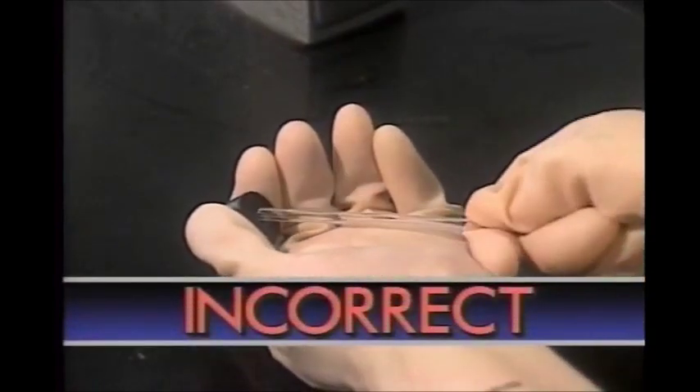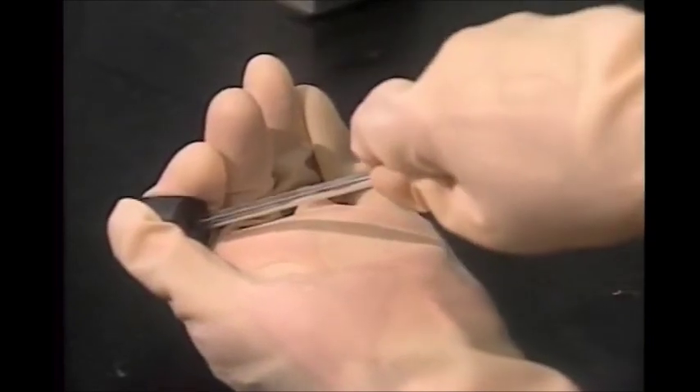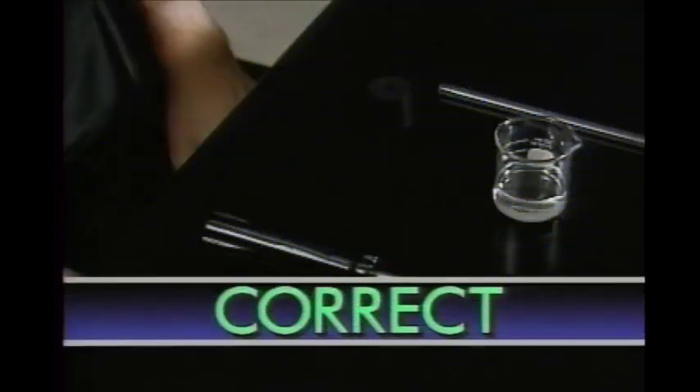The most common lab injuries are cuts from broken glass, especially glass tubing. A typical accident comes from using too much force to push a tube through the hole in a stopper. One way to avoid this kind of accident is to use an inserter.